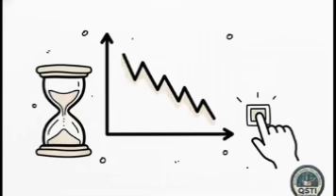When you're doing the span gas, the span key will pop up during the transition. You just follow the exact same rule. Wait for stability below 0.5, hit span, and press ENTR.